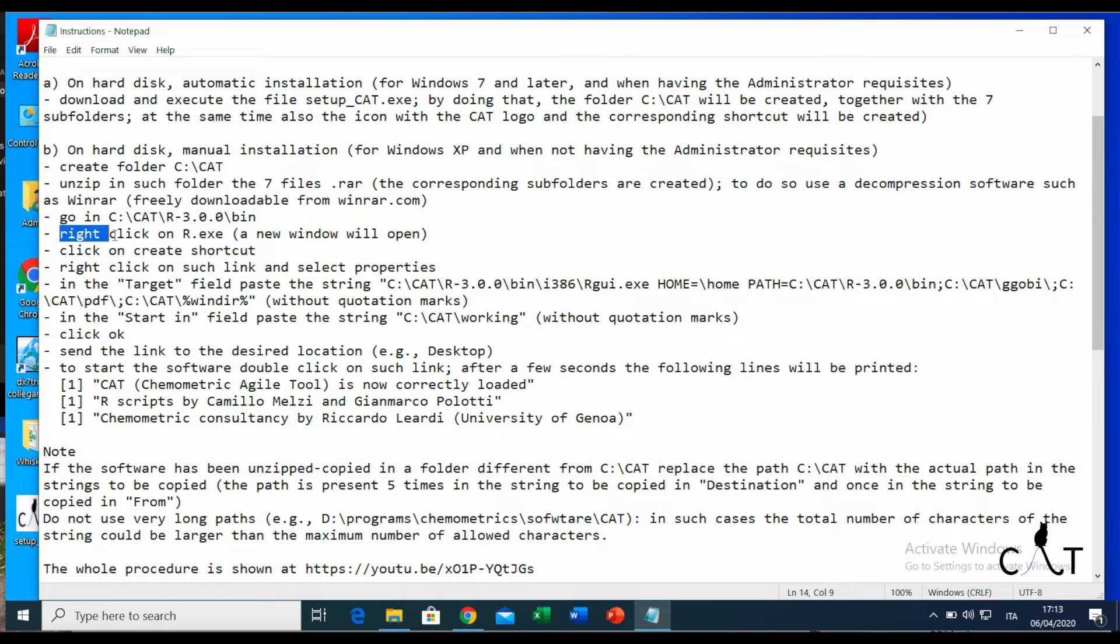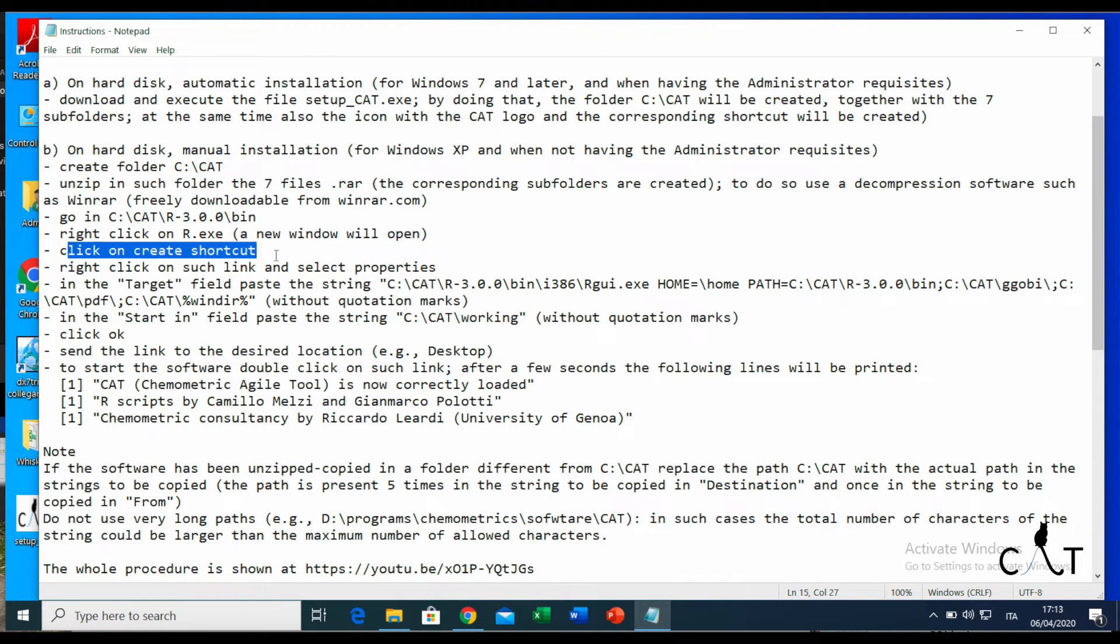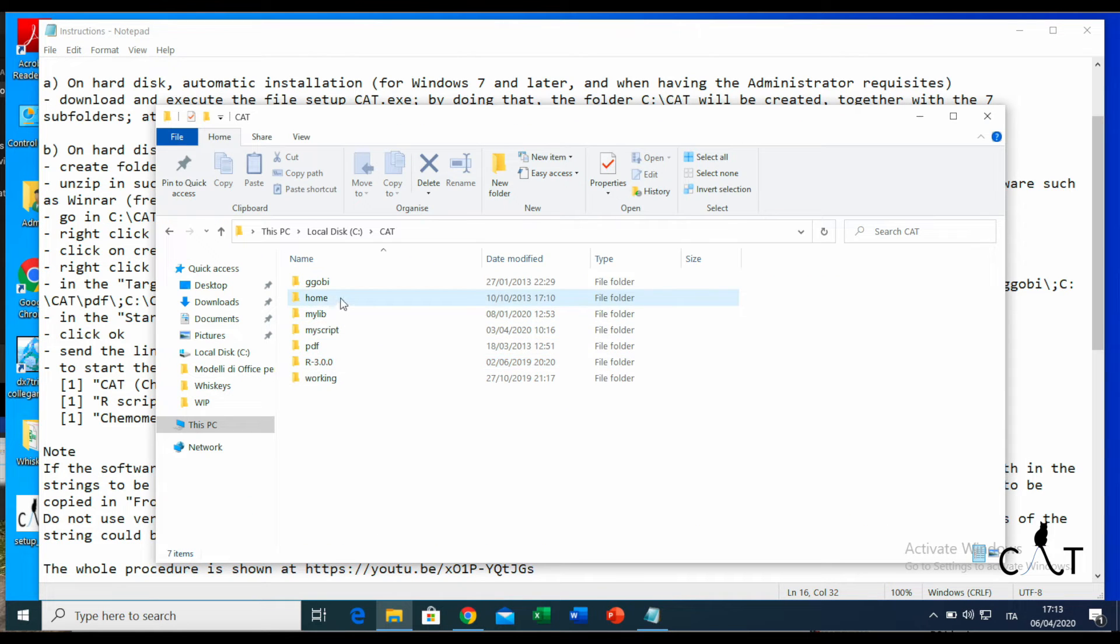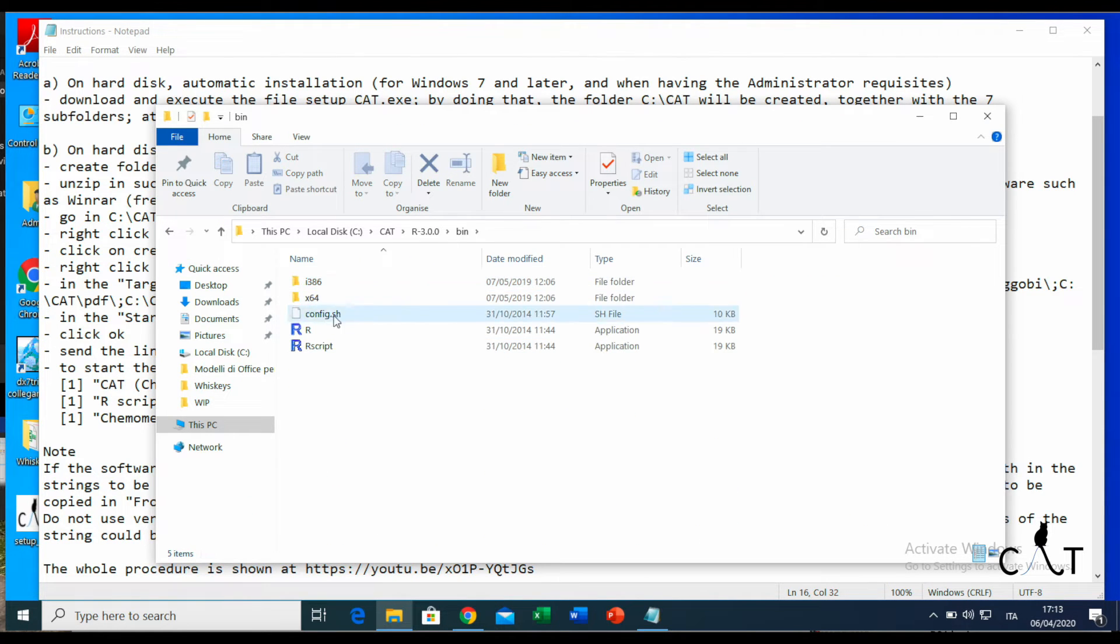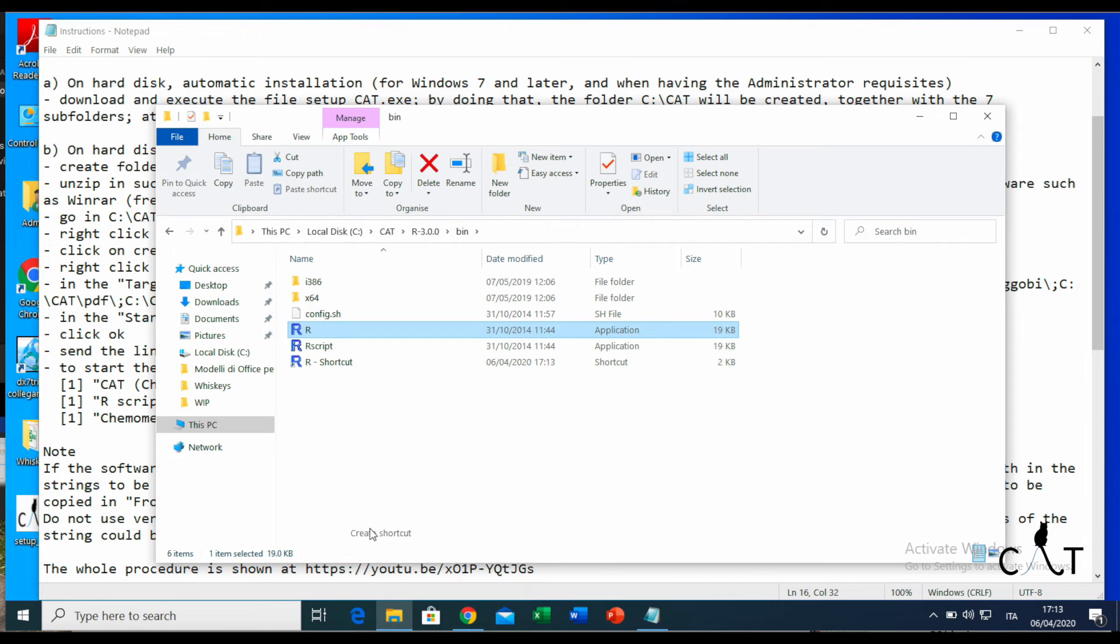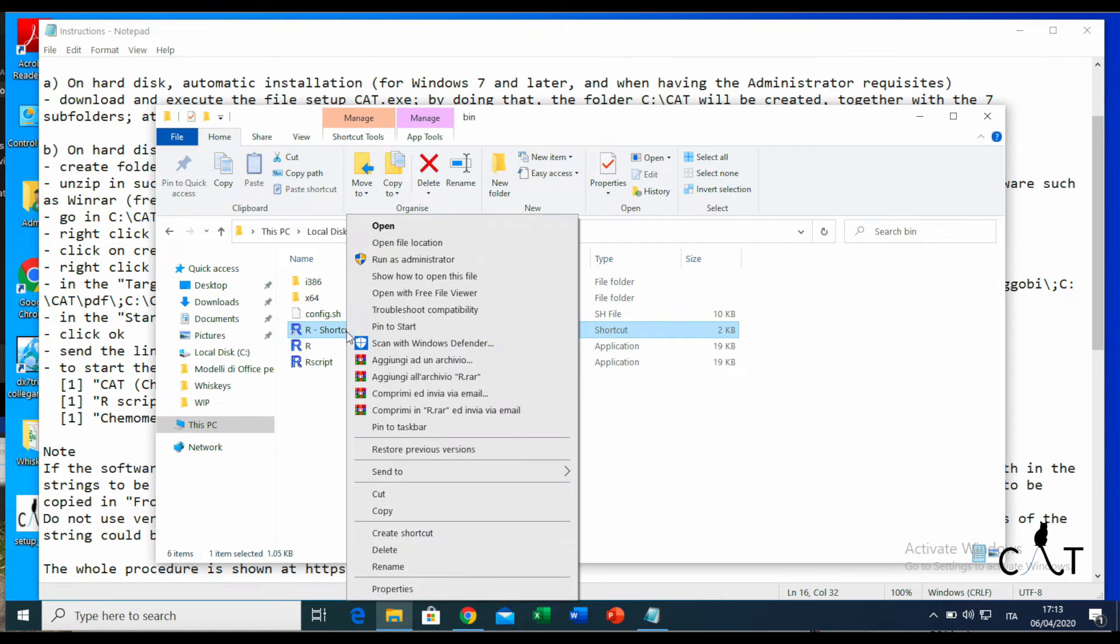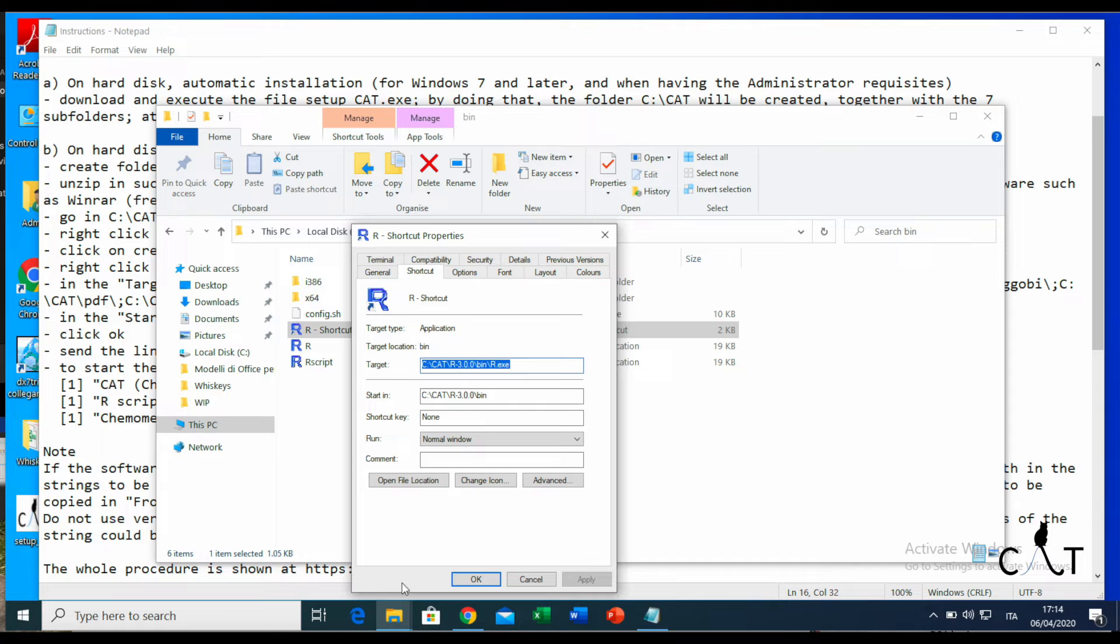Now we have created the folder and done the unzipping. Now we need to right-click on Rx to create the shortcut. We go to bin, to bin, to Rx, and we create the shortcut.